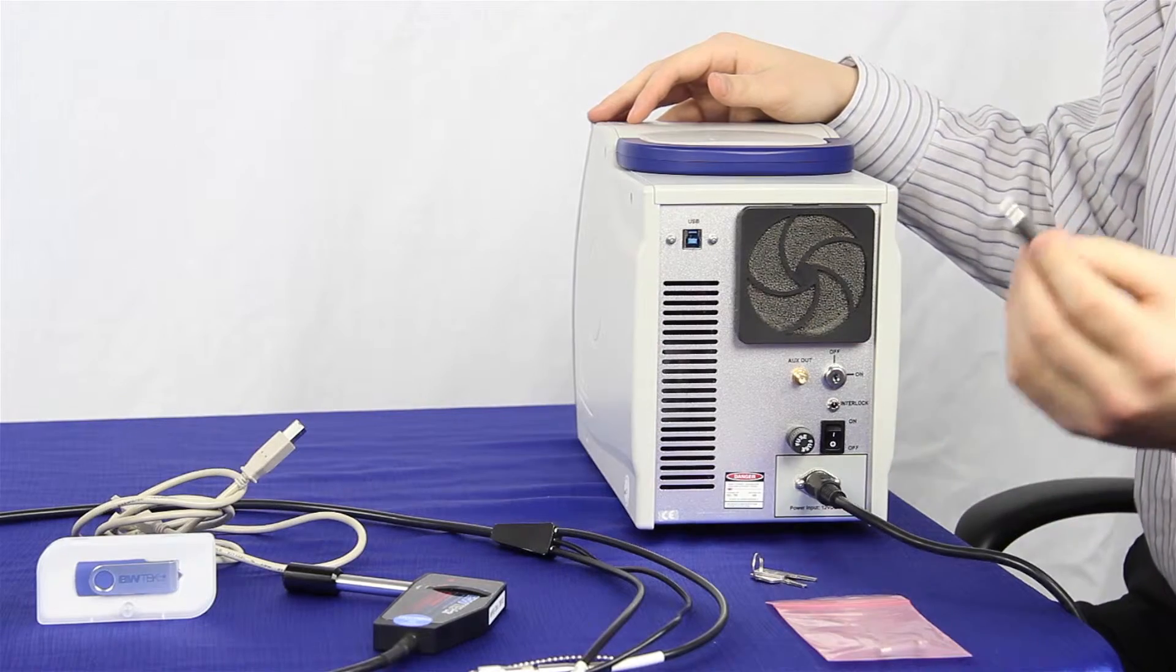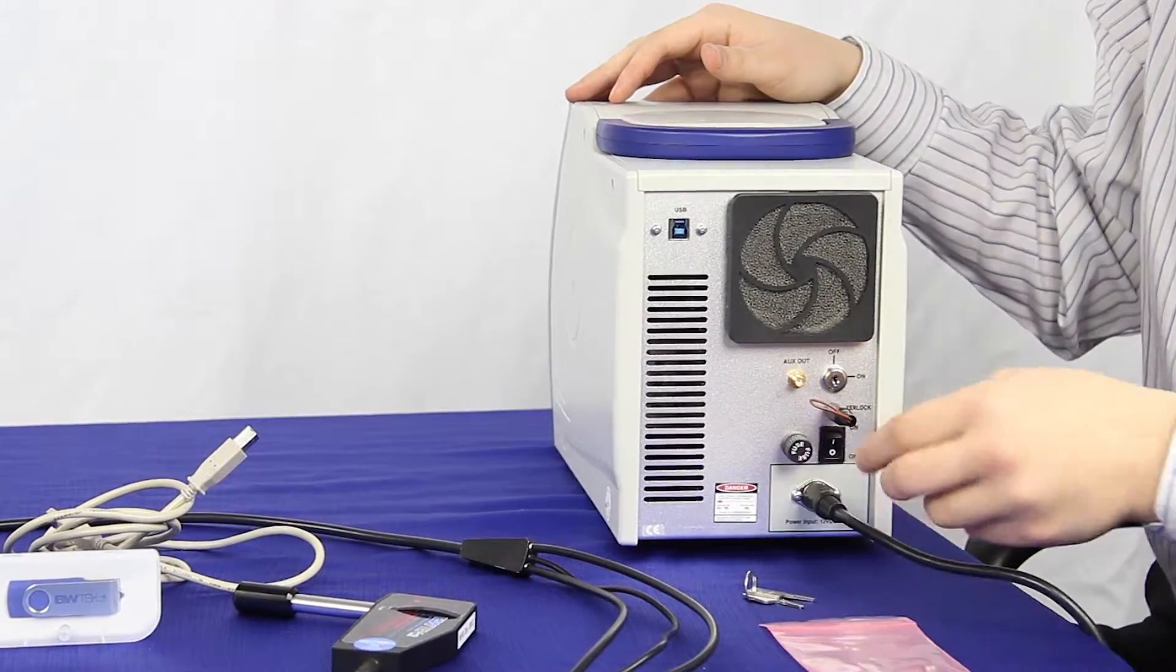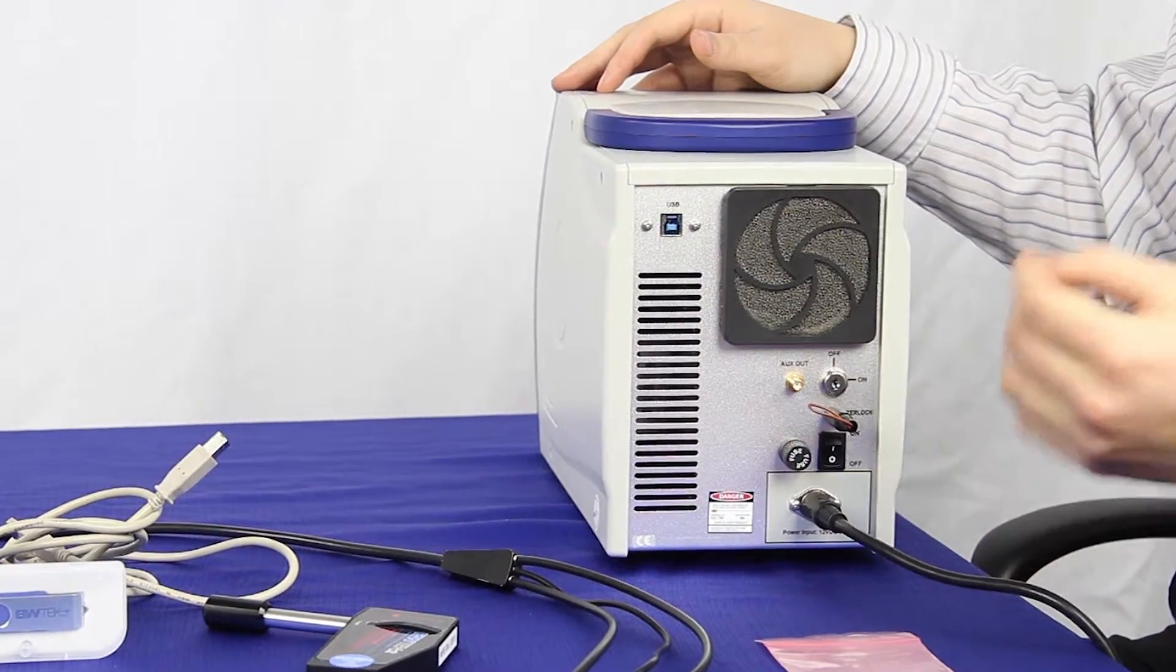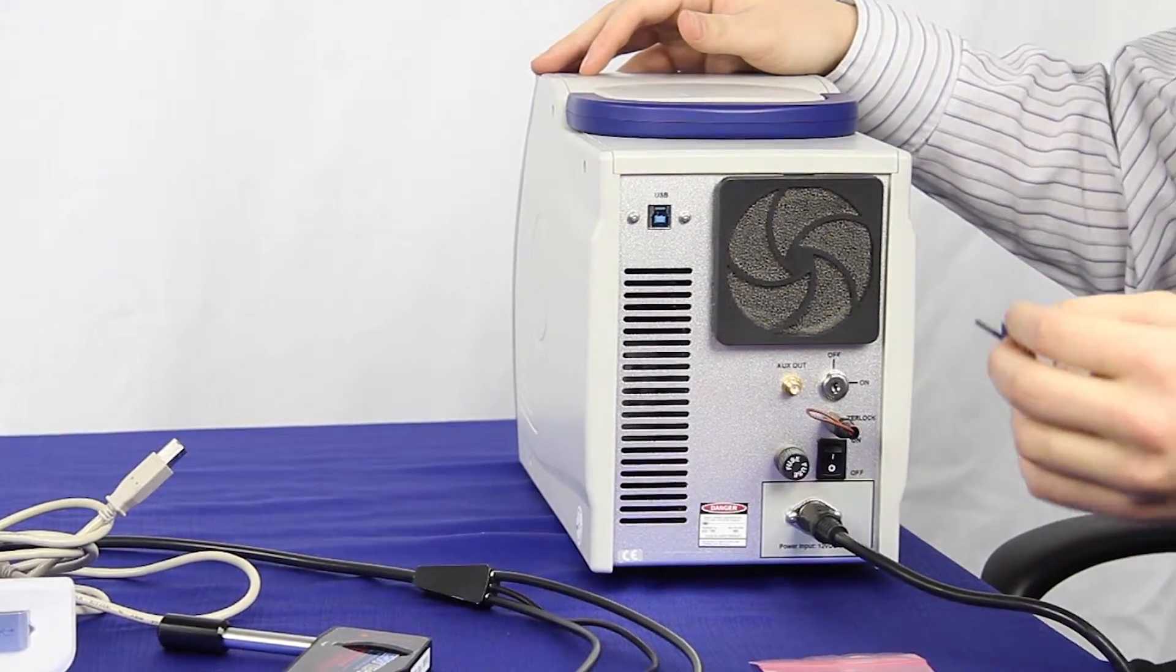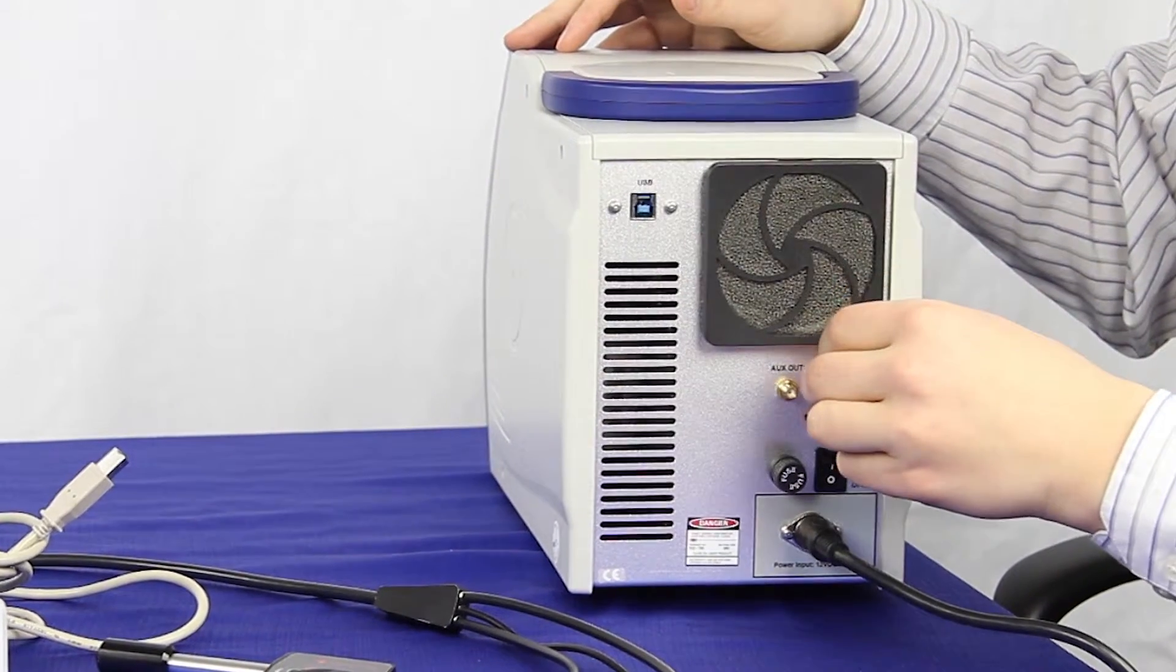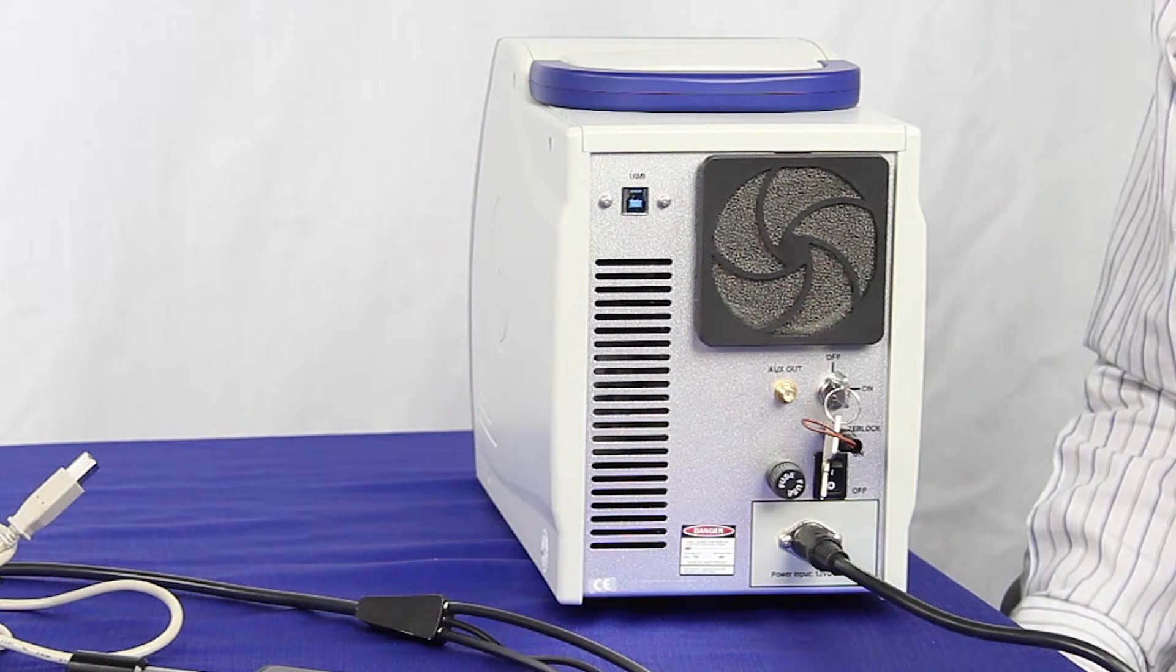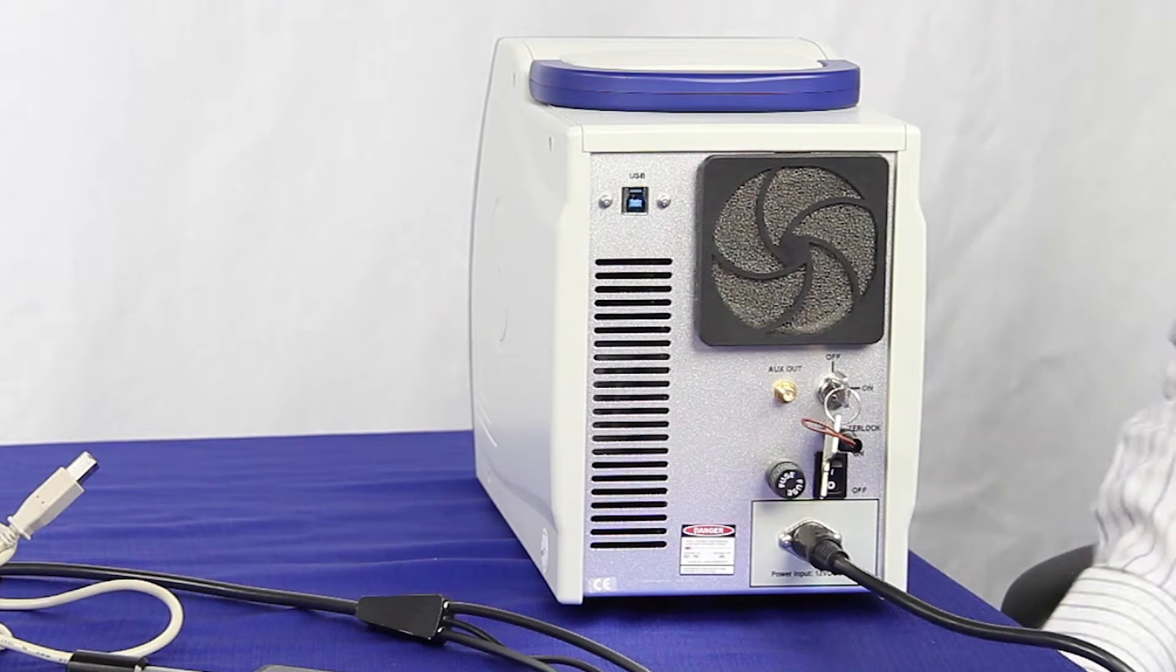You're going to take the interlock and plug it into the hole marked interlock. This allows for the current to actually run and it is a safety feature. You're going to take your laser safety key and plug it into the keyhole here. This allows you to turn your laser on and off. This is also a safety feature.